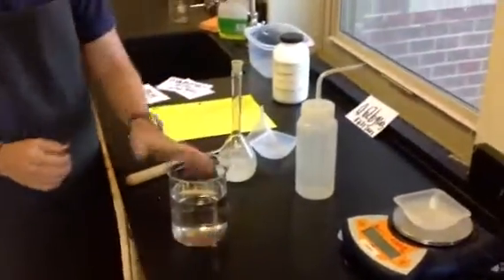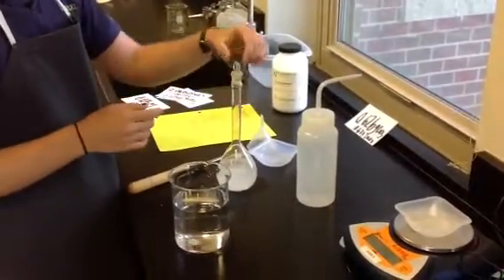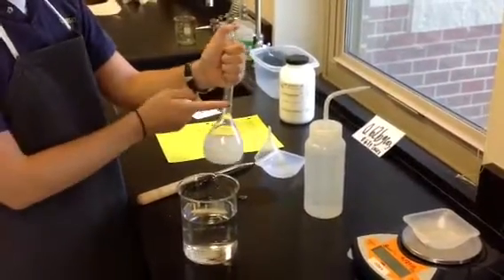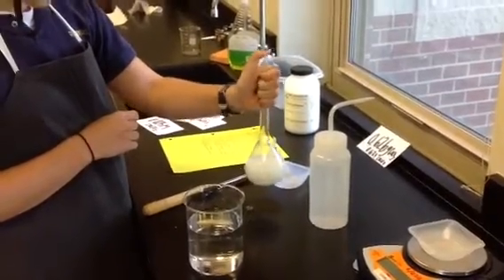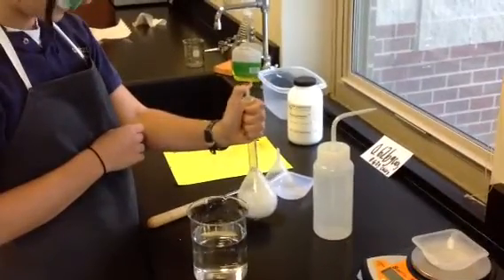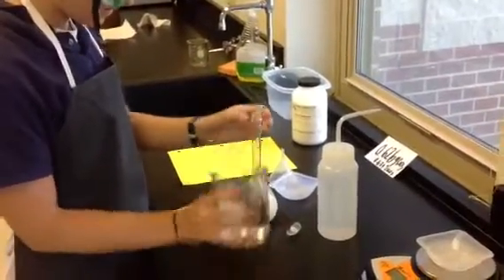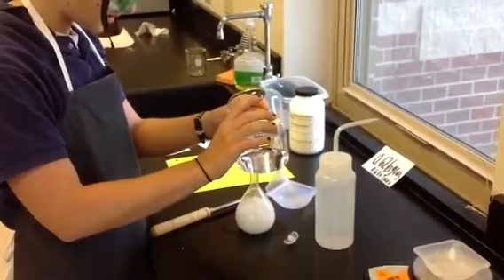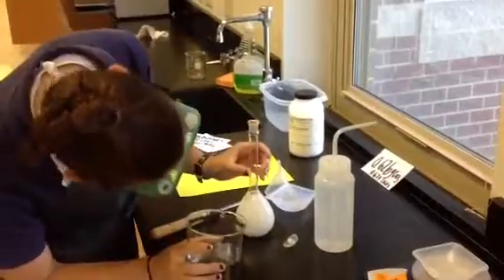Before I fill up my volumetric flask all the way to the 250 milliliter mark, I have to put in a stopper and then shake it and mix it up, because if it gets all the way up to the 250 milliliter mark it's too difficult to mix. So I'm going to mix up my solution first, and then fill up the rest of my volumetric flask all the way to the 250 milliliter mark, which is all the way up here.